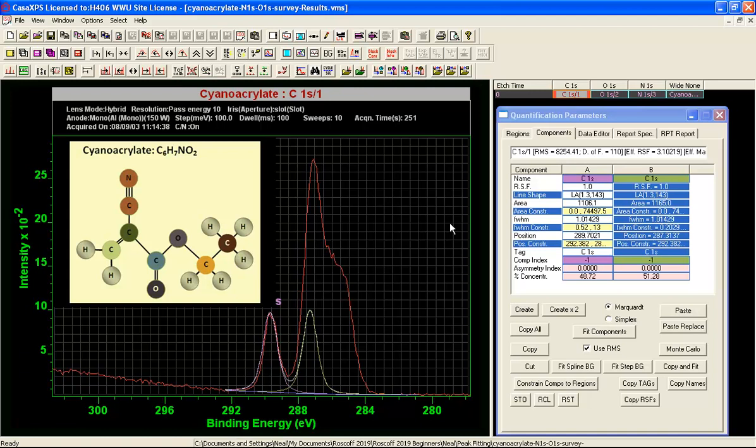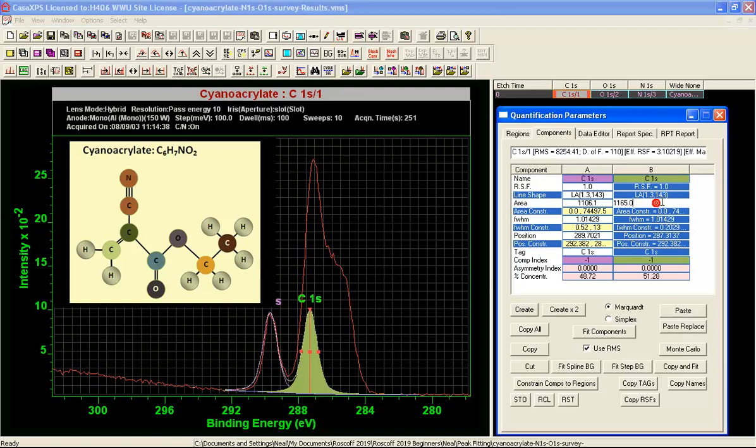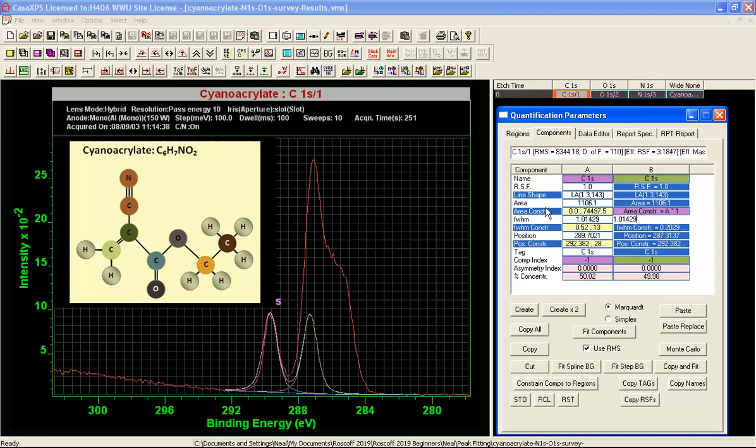Then we have potentially got a one to one relationship between these peaks. So what we'll do is we'll enforce this by introducing a constraint in column B saying A star 1. So now these two peaks have the same area.